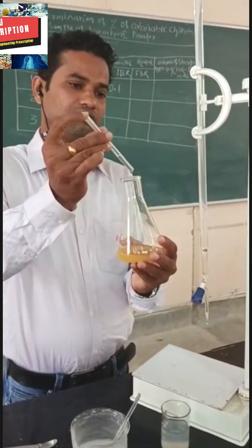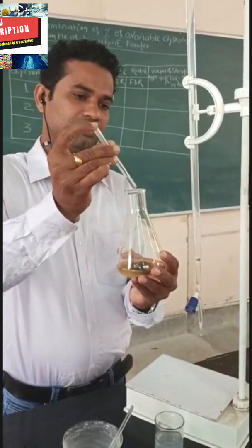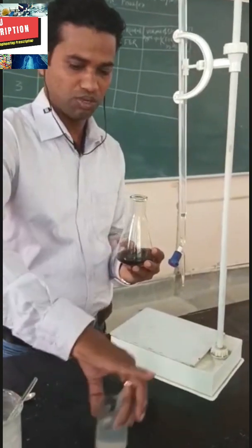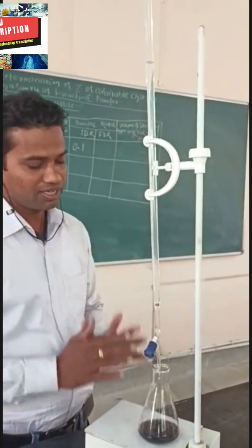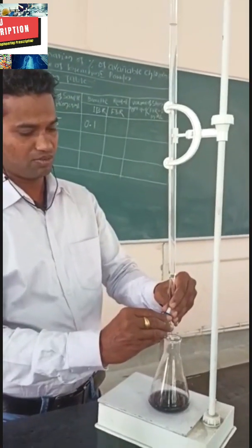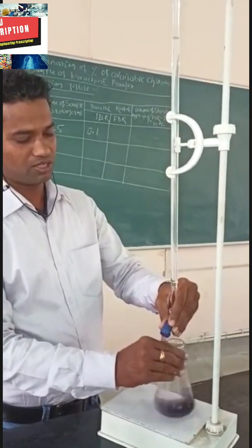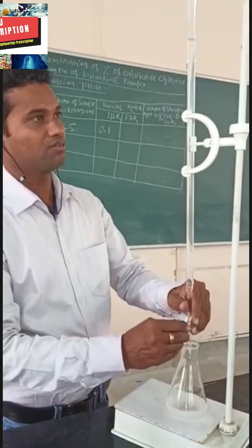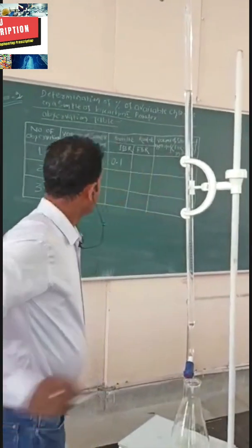One, two, three, four — now blue color appears. Continue addition of hypo solution from the burette until it disappears. Add dropwise and slowly up to colorless. When colorless, stop the addition and note the reading. This is the end point.